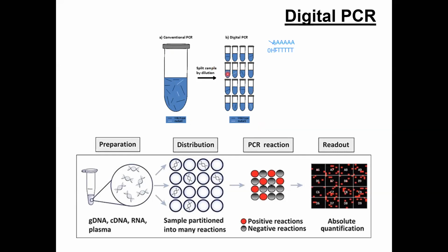So when you run the PCR, some of the wells will amplify and some will not amplify. Then you'll be able to see that if you probe it with a fluorescent label. From here, the reds are the positive ones and the gray ones are the negative ones. So you'll be able to run hundreds and thousands of reactions at a single time.